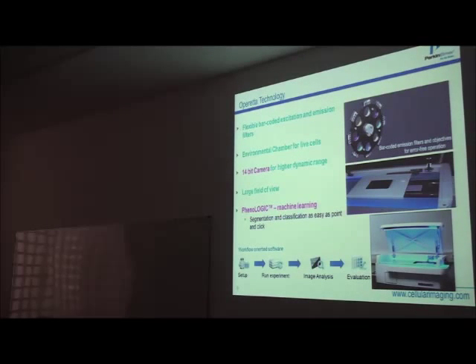There are some nice features like barcoded filters, but also objectives. This is for a multi-user environment. So if your colleague removes something from the machine, like an objective or filter, without telling you, you will not be able to use those parts, because if they are not in the system, it will not allow you to use them. So this is to minimize errors. Right, so we use barcoded filters and objectives.